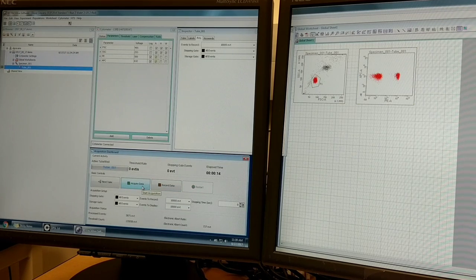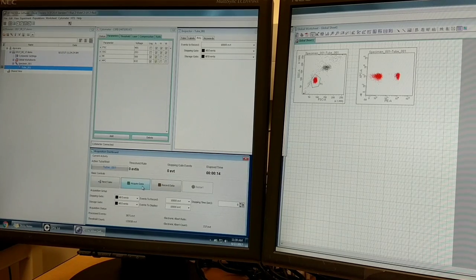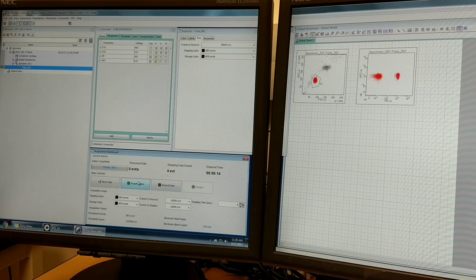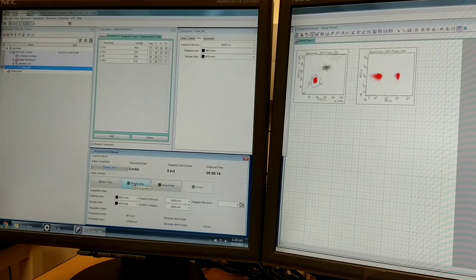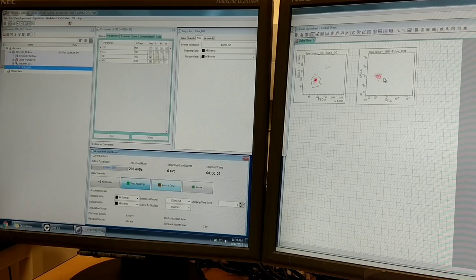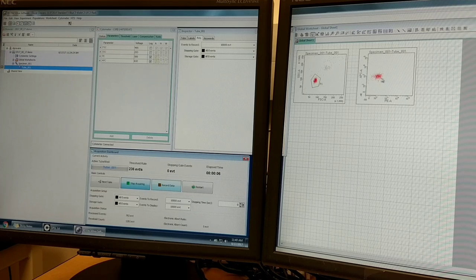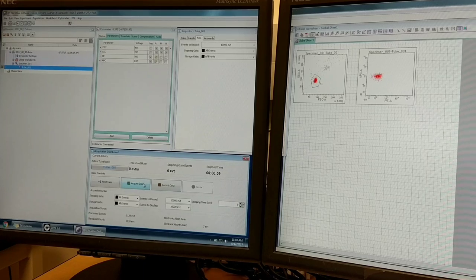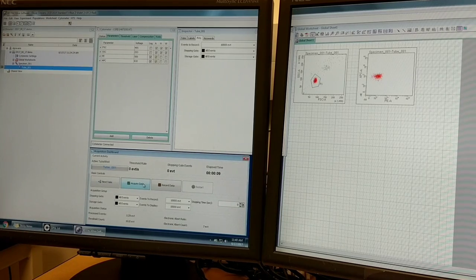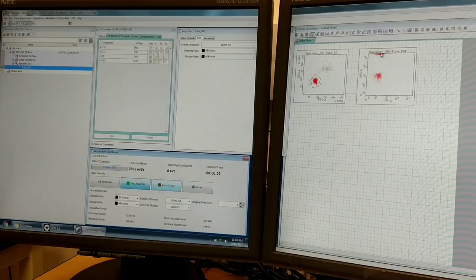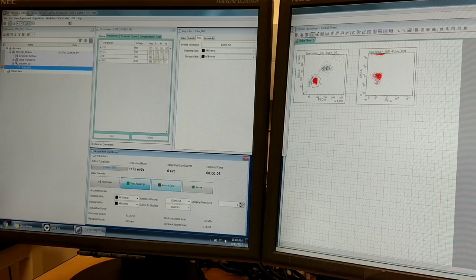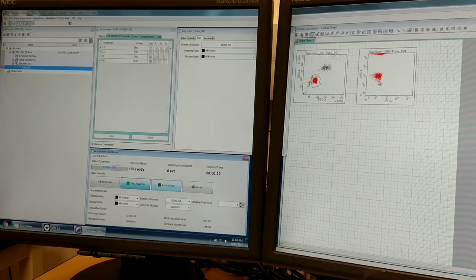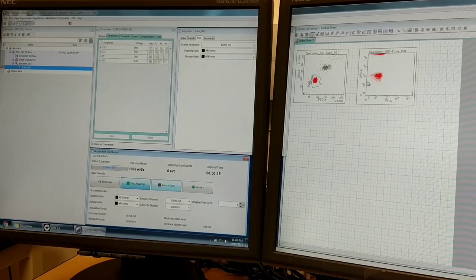I'm going to move on to APC. I've loaded my APC tube, and remember I haven't recorded anything yet. I've only even still got one tube. I haven't even created new tubes yet. As I mentioned before, I have an unstained population in this tube and the stained population in this tube. That's really important when you're setting it up to have both a negative and a positive population, especially important for compensation.